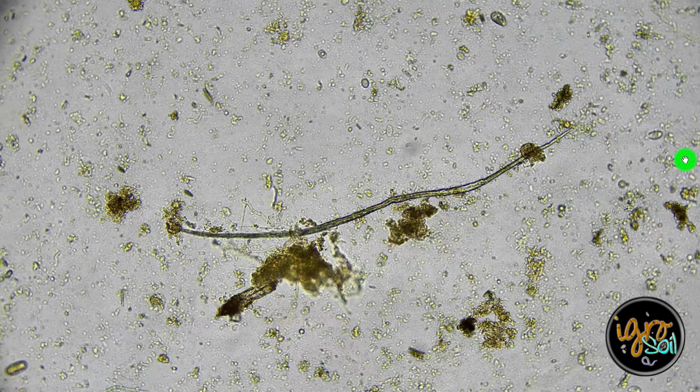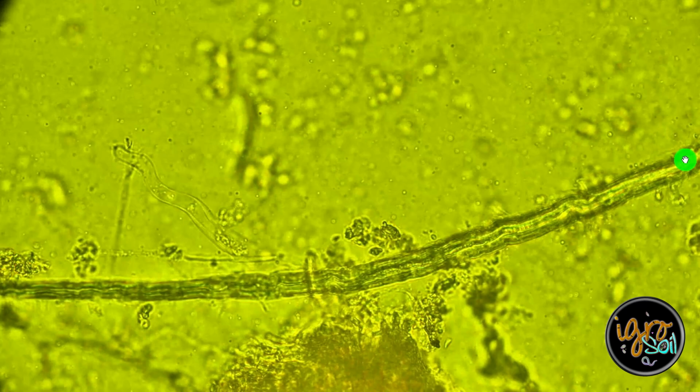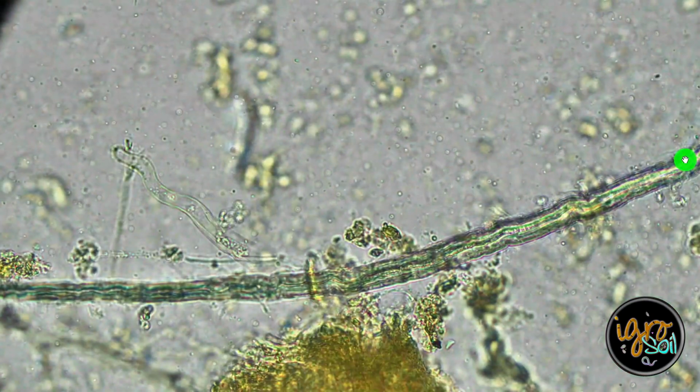The one great thing about the epifluorescent light is it will expose it, and it normally glows. In this case, it's not. Maybe it's not a microplastic. That would be a good thing. Yeah, it's not glowing. So then what is that? If that's not a microplastic, what is it?